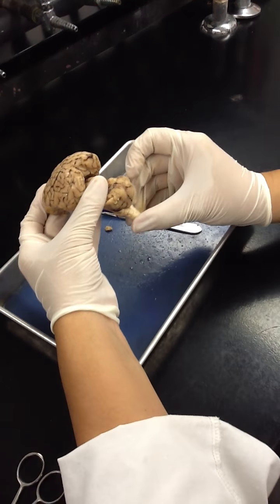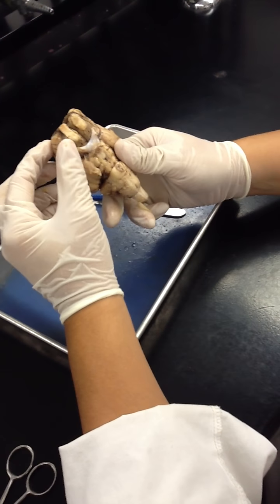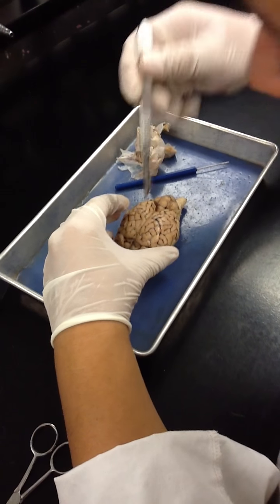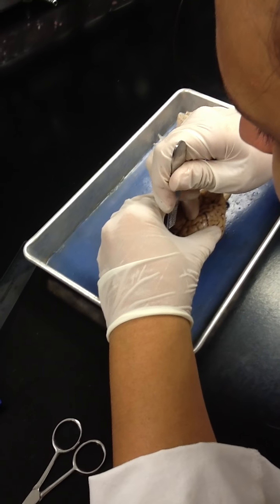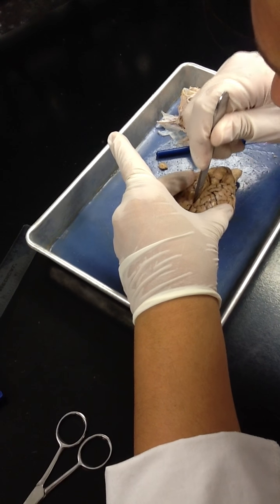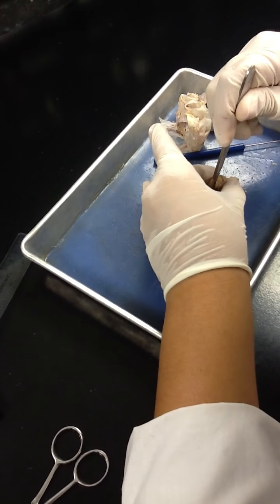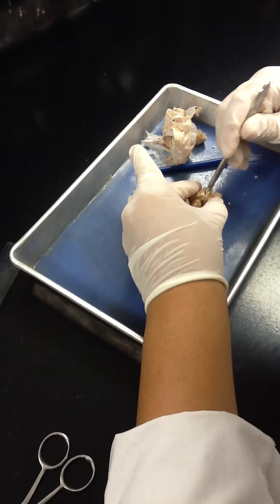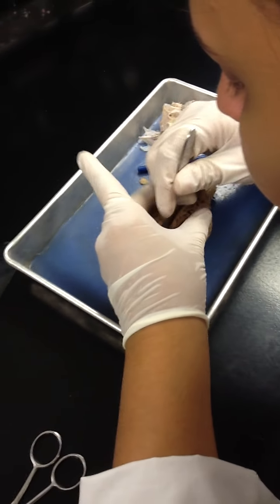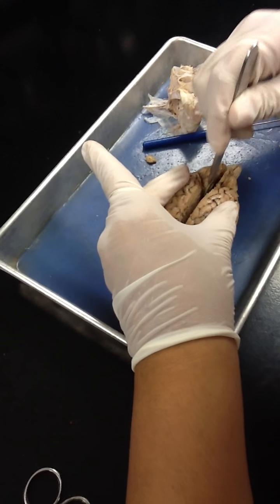Okay. Now, can somebody get me a knife? Actually, I can cut it with the scalpel. Nobody wants to see. And I have to wash this. Disgusting. You'll be able to send the video. Like a weird... I think so. Oh my god. Okay.